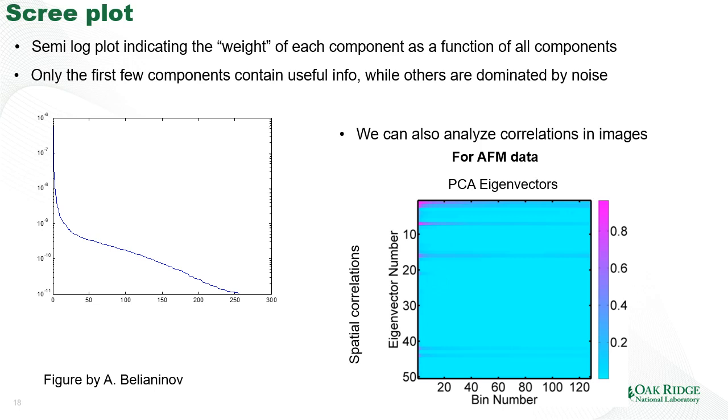analysis. What's interesting though, is that in this particular experiment, component number 8 and component number 17, and even the components between 40 and 50, have long-range correlations. And very often we can look at the specific maps and find out that there is some subtle physics of the sample that is very, very weak, but nonetheless can be detected by the principal component analysis.